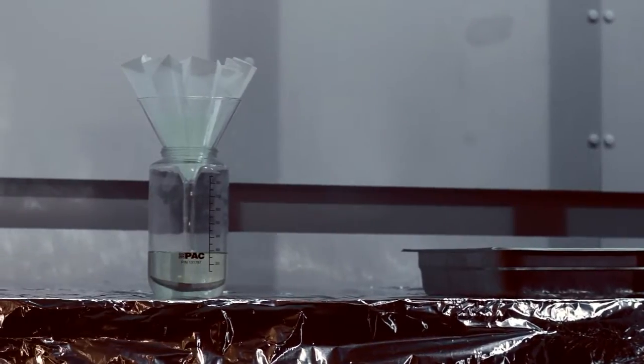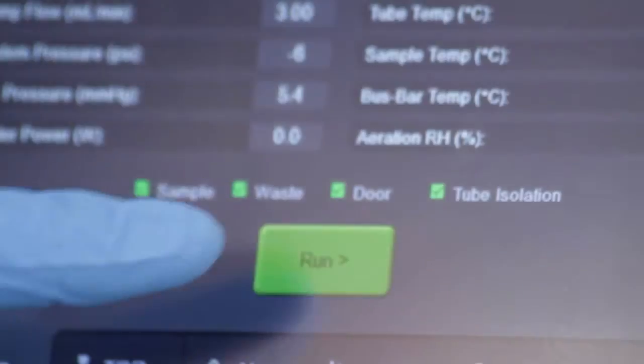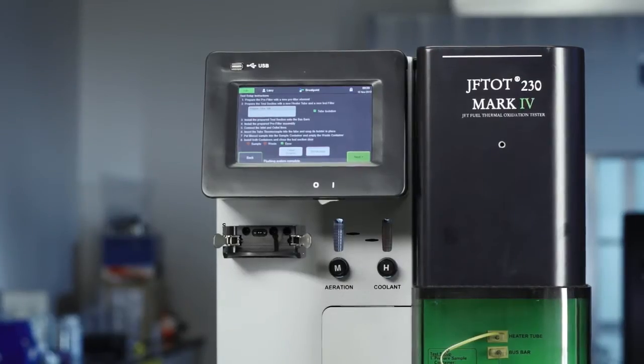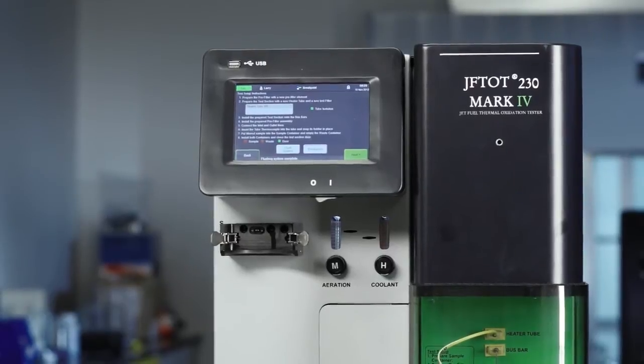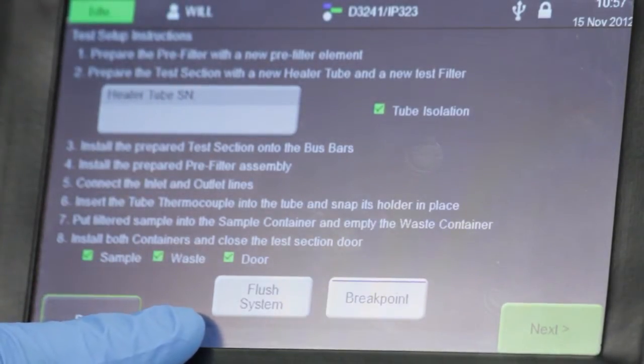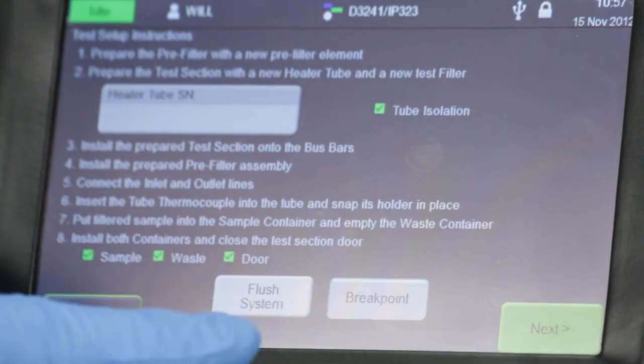While the fuel is being filtered, select Run from the home page for the Test Setup Instruction screen. This lists all the steps to assemble and install the test components to the Jephthah. You'll also see button commands on this page that allow you to manually flush the system or to start the automated breakpoint program.